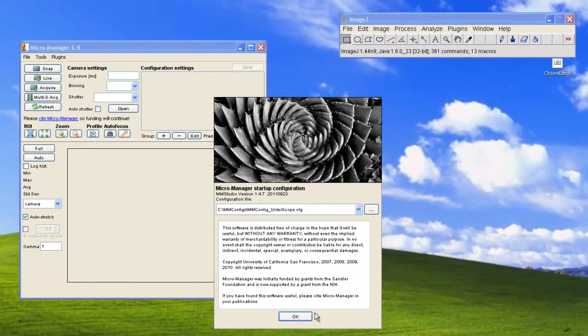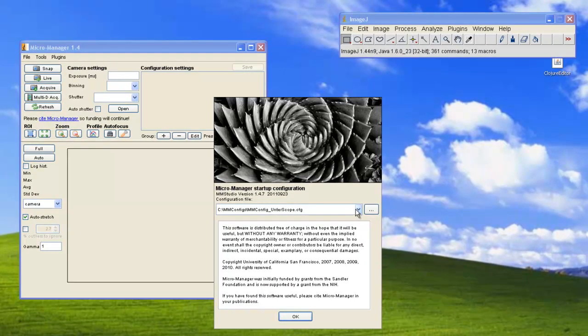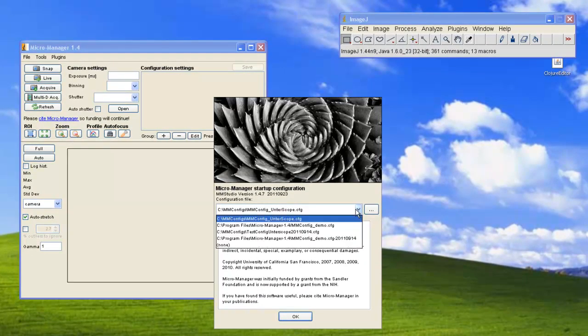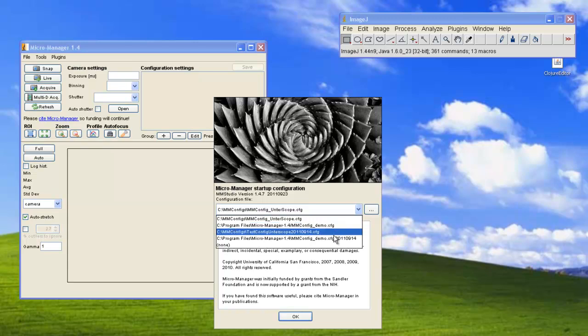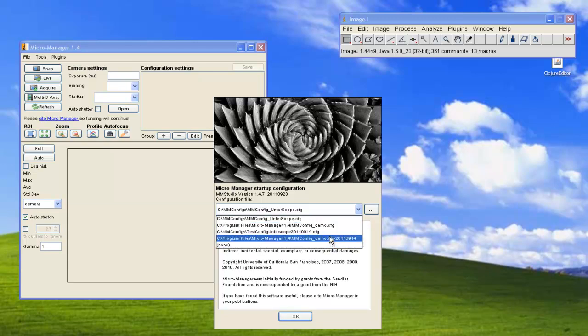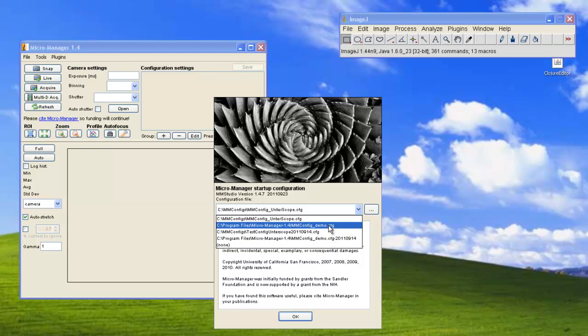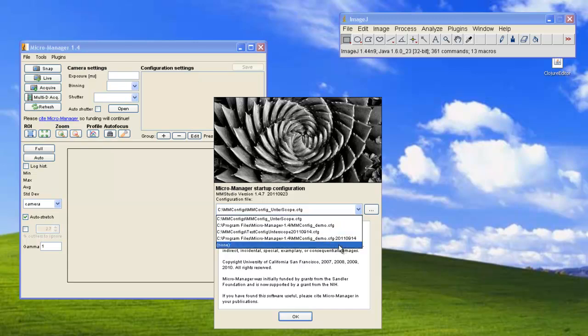When we first start MicroManager, we see the splash screen which has general information regarding MicroManager that we recommend you to read. From this window, you can start MicroManager by selecting a particular configuration file. You can do this by choosing from the various files that have already been set up on your system.